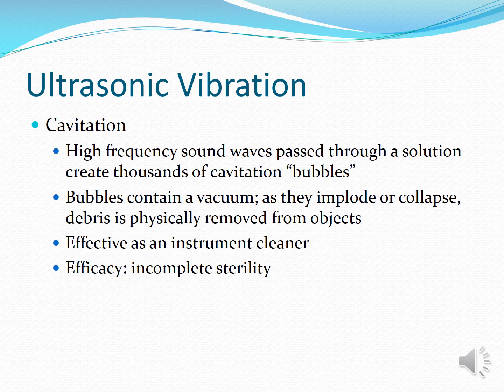Next is ultrasonic vibrations, like cavitation. High energy or high frequency sound waves pass through solution, creating thousands of cavitations or bubbles. These bubbles contain a vacuum as they implode or collapse, and the debris is physically removed from the objects. So the efficacy is incomplete sterility, and it is effective as an instrument cleaner.